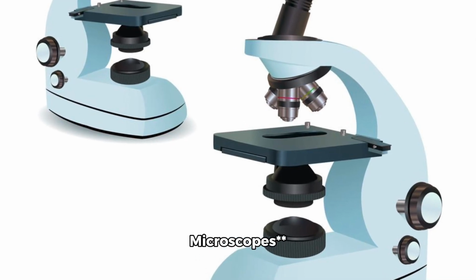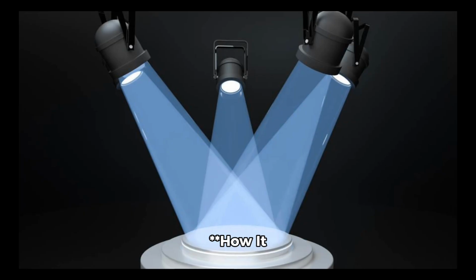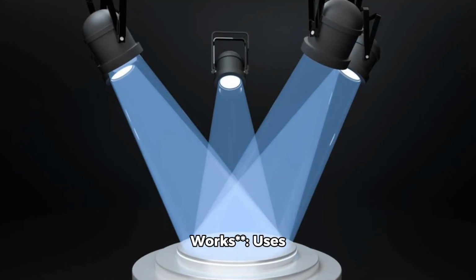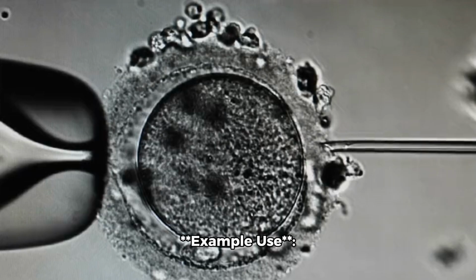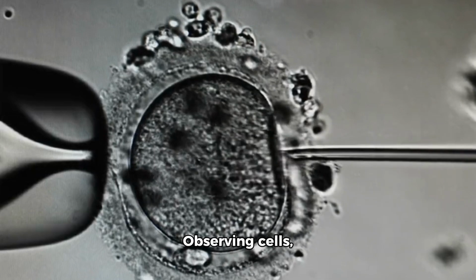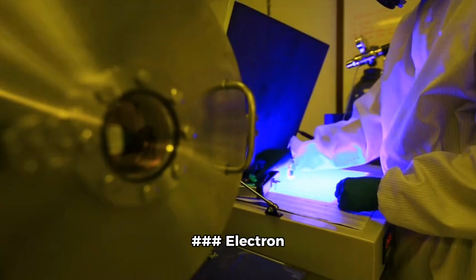Types of microscopes. Light microscope. How it works: uses visible light passed through lenses. Example use: observing cells like onion cells.